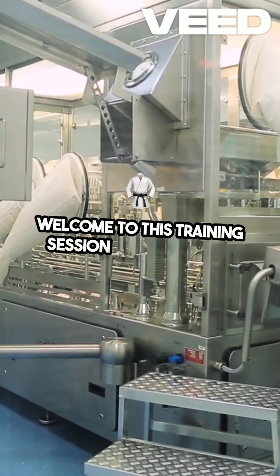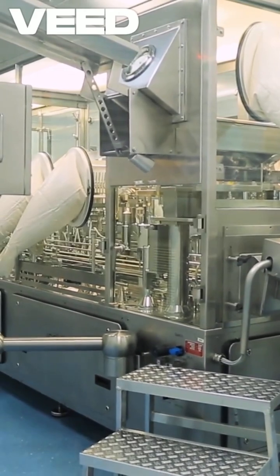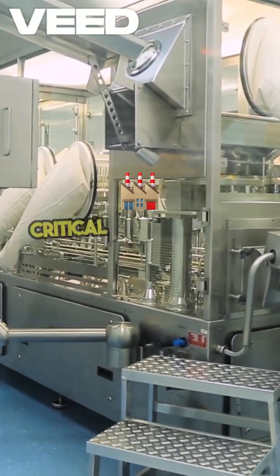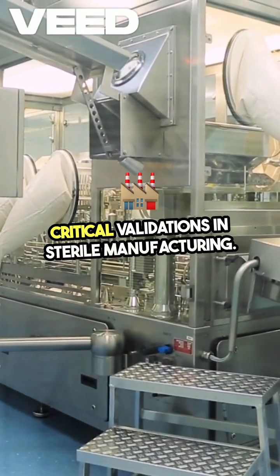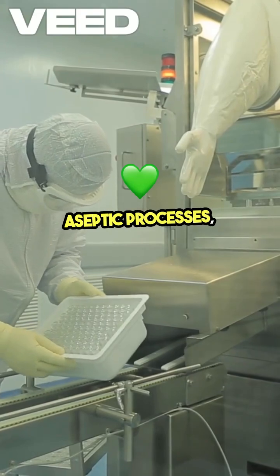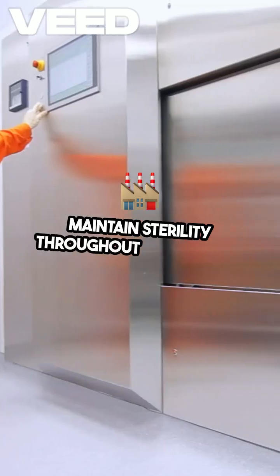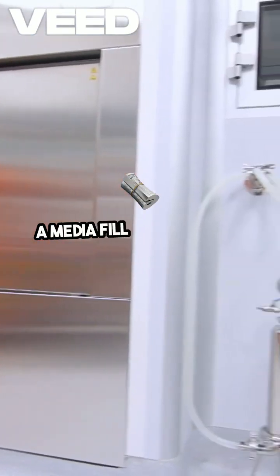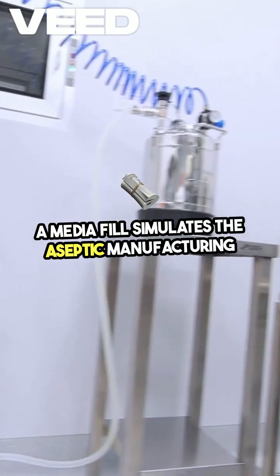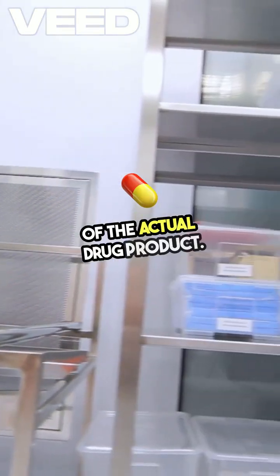Welcome to this training session on media fill, also known as aseptic process simulation. This is one of the most critical validations in sterile manufacturing. It demonstrates the capability of our aseptic processes, environment, and personnel to maintain sterility throughout production. A media fill simulates the aseptic manufacturing process using a sterile growth medium instead of the actual drug product.